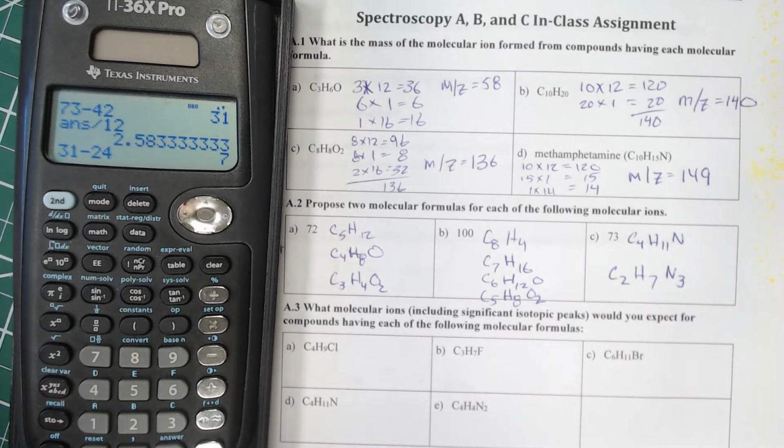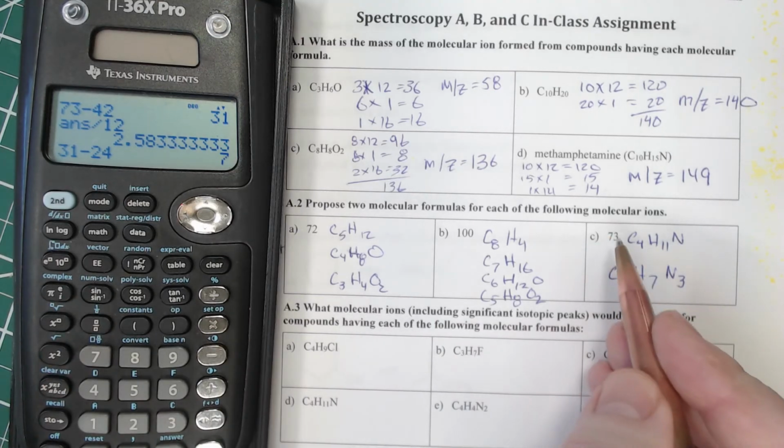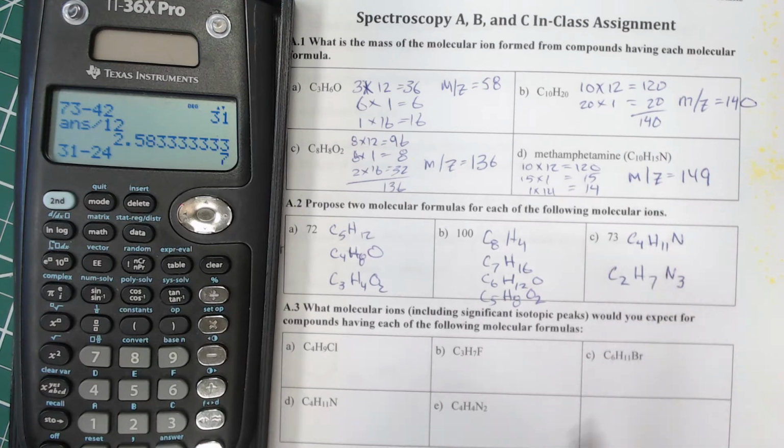All right, so I want you to be able to determine some possibilities, at least one possibility for a given molecular ion. And I also want you to know that odd number rule about nitrogen. So let's switch back over.